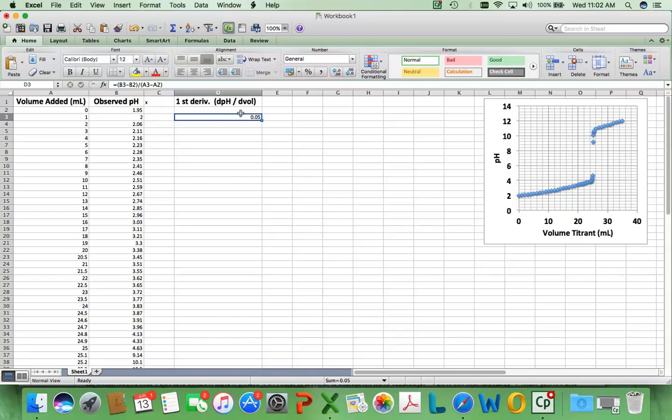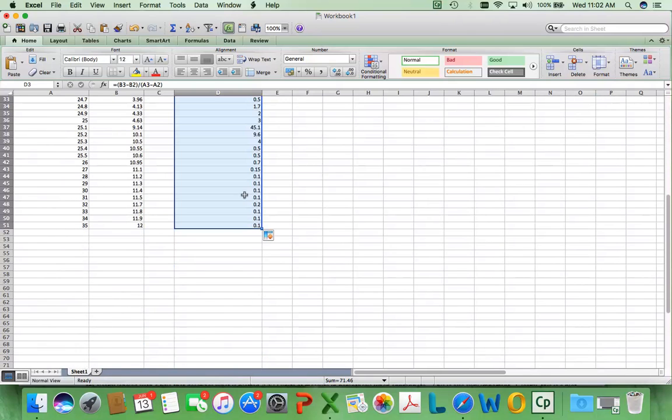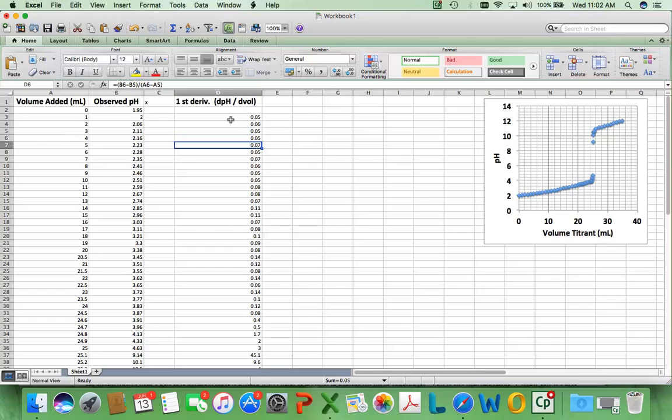Now does that result make sense? I think it does, right? Because if we double check the math in our head, if we do this cell minus this cell, it's 0.05. And if I divide that by 1 minus 0, that's dividing by 1. So 0.05 is our result, right? So that makes a lot of sense. Now the beauty of entering the formula, so you have to do equals and then the cells and the mathematics, okay? But the beauty of entering that is I can essentially copy and paste that down the column all the way through my data series. And boy, that makes my life a lot easier. Because notice I didn't have to think about the result for any of the other boxes, right? I just copied and pasted it.